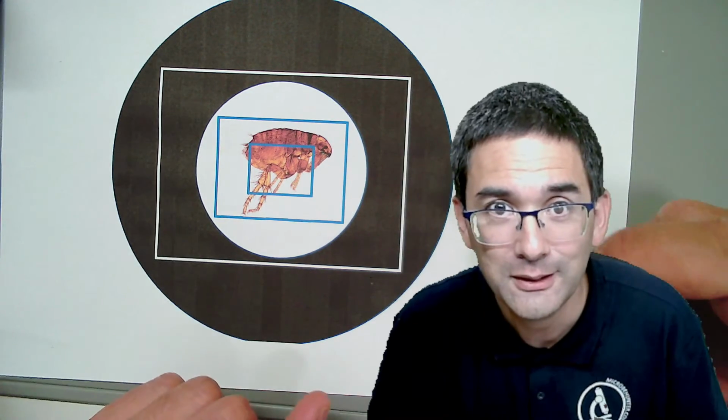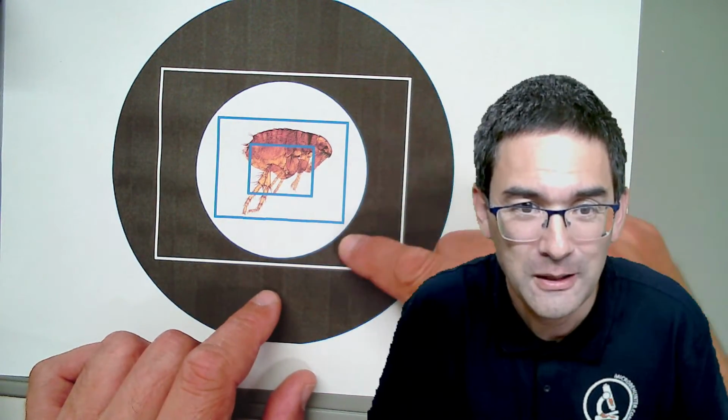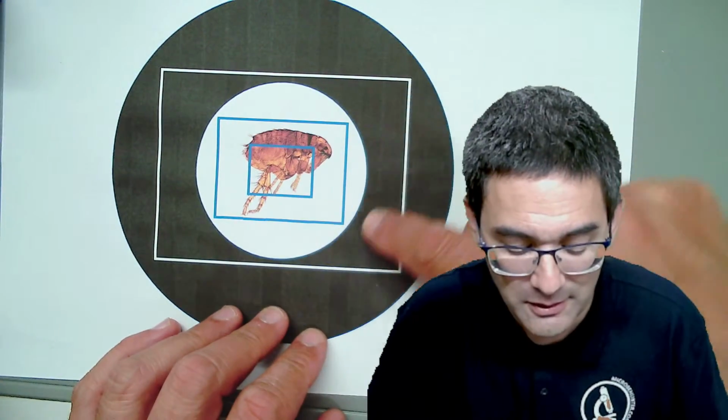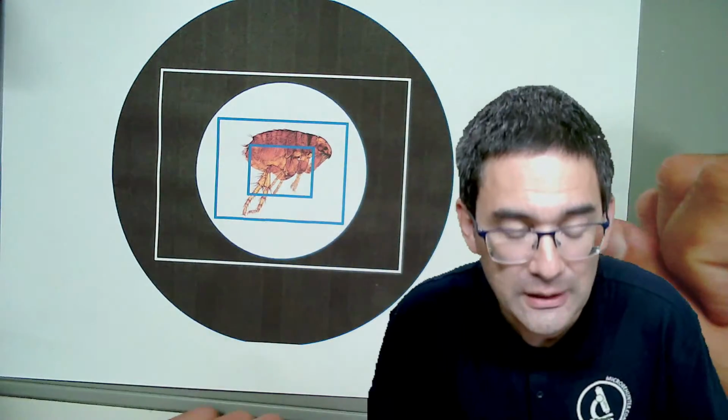And then if you, for example, hold a mobile phone in front of the camera, you get a very large field of view. As a matter of fact, so large that you're even able to see the complete circle. You're kind of wasting a little bit of pixels over here as well, because that's not needed, and you have to zoom in later on.